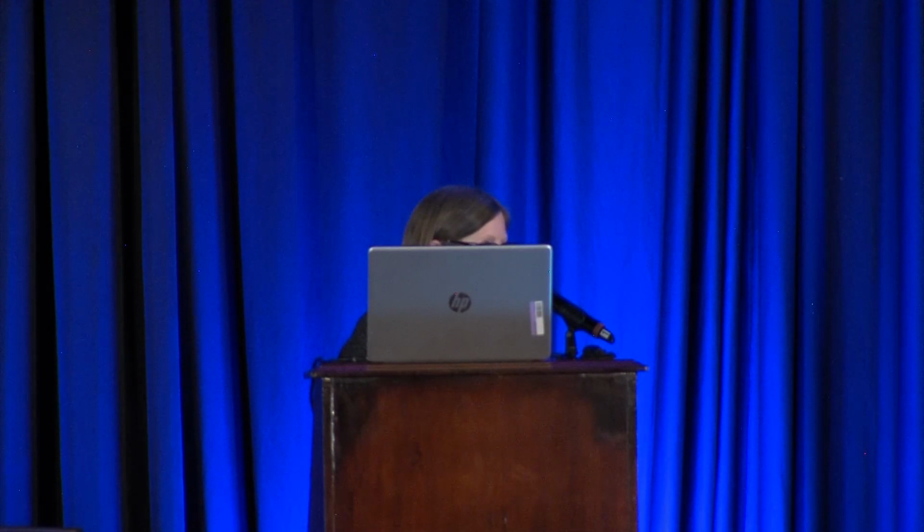I like the laser technology for the quick updates. Could you tell me how many components I can measure with a single laser analyzer? Ideally, I'd want to measure 3, 4 components in a single laser. Do we have that capability? So how many components we can measure in a single analyzer? In a laser analyzer, yeah.